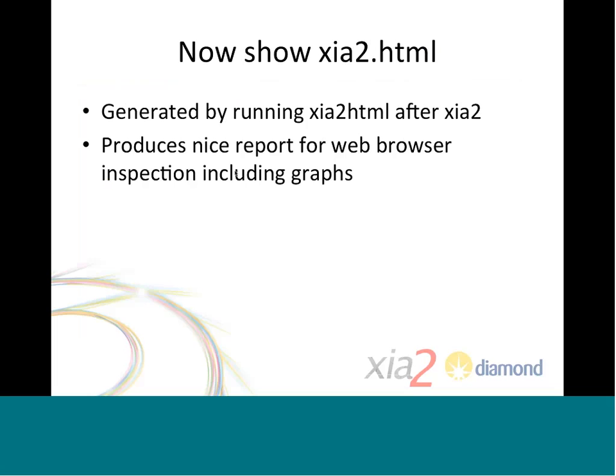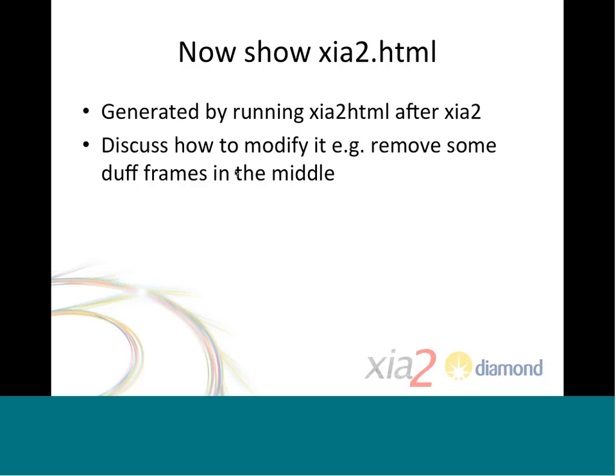Okay, so moving on, I'm possibly running a bit short on time, I suspect, so I'm not going to discuss xia2.html. But if you run this after XIA2, it generates a nice HTML report which shows much of the same information but in a more browser-friendly manner.